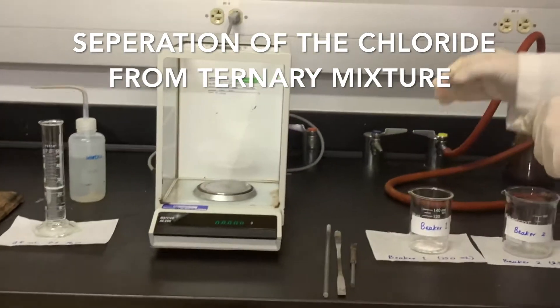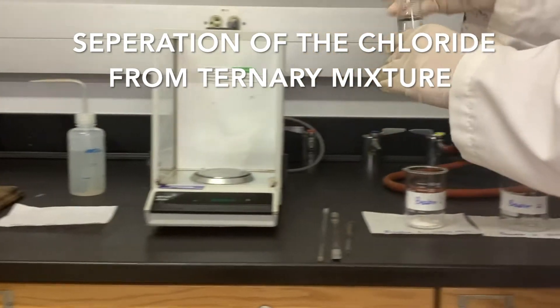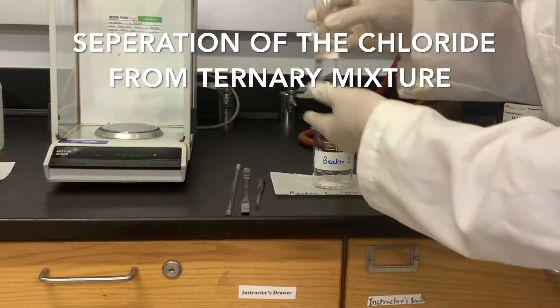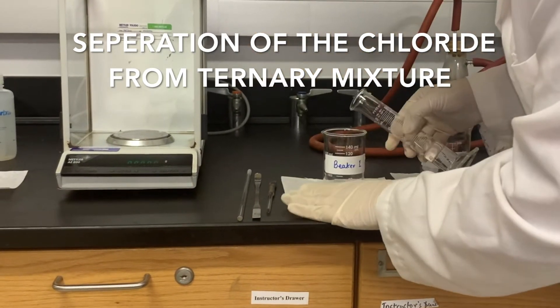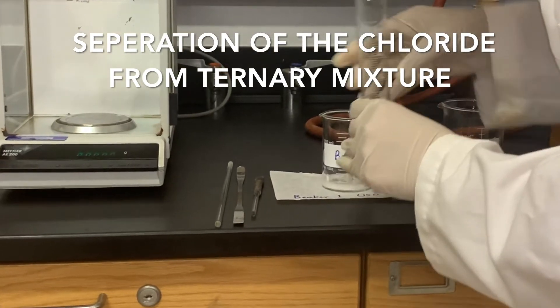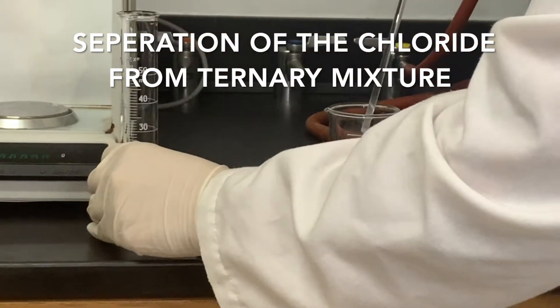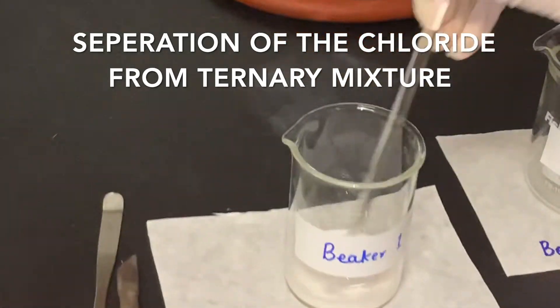Now I'm going to add 25 milliliters of DI water to this mixture. I already measured the 25 milliliters of DI water in the graduated cylinder. With the help of the glass rod, I'm going to stir it.